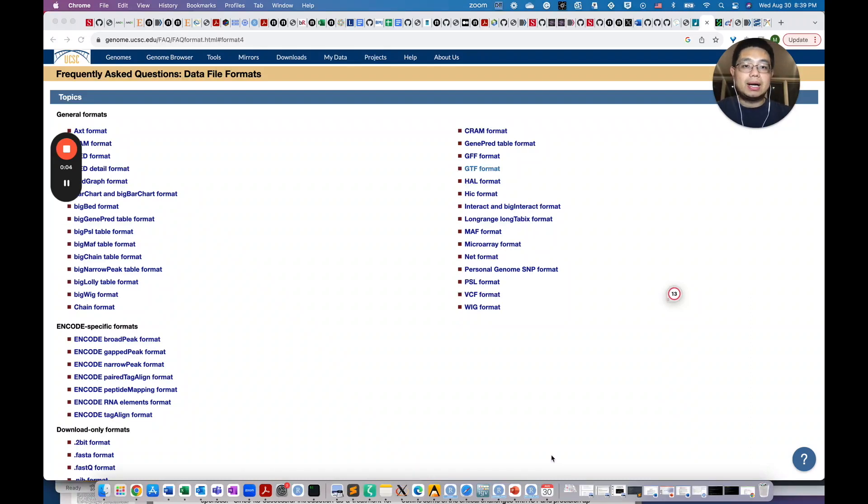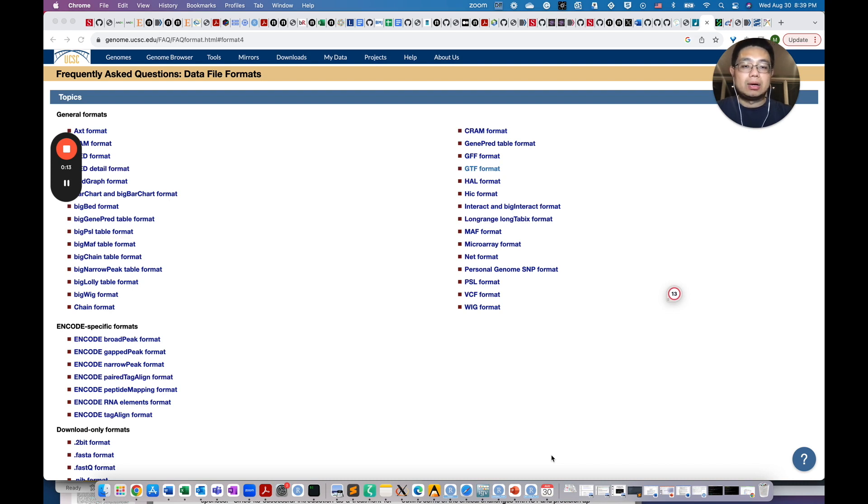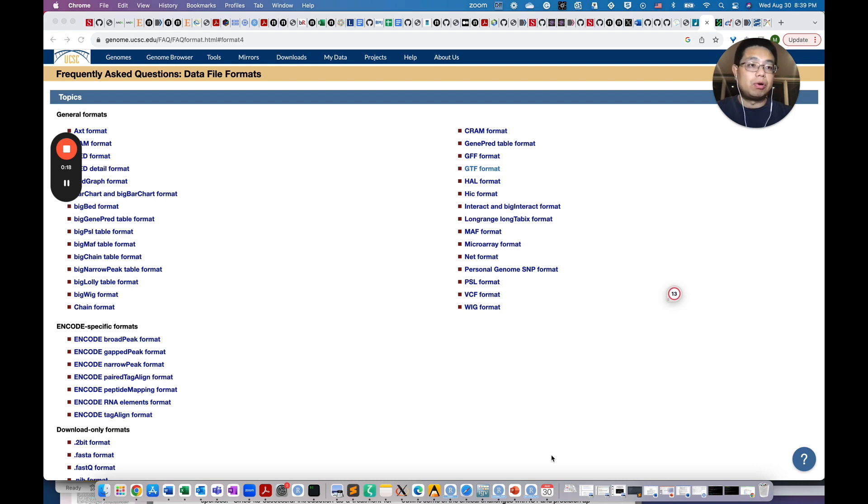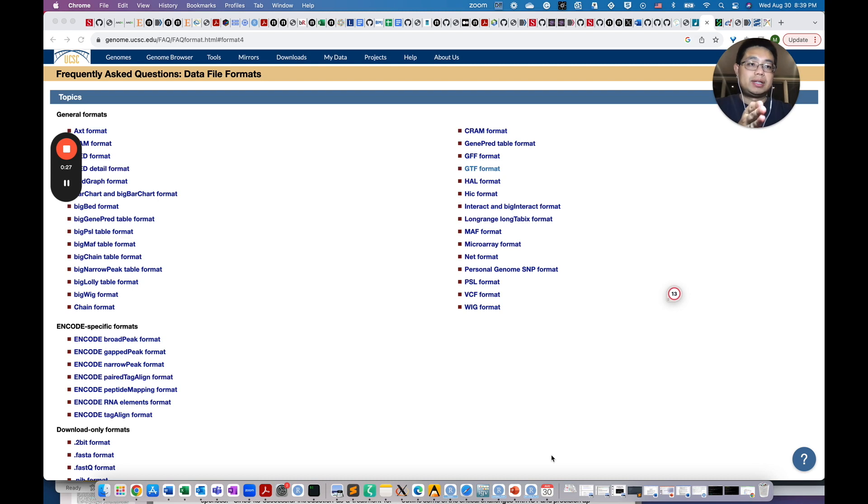In this video, I'm going to share with you four different places that you can download genome and transcriptome FASTA files and also gene annotation files such as the GTF file or gene transfer format. It tells you, for example, from chromosome one, this coordinates to this coordinates is gene one and this coordinates to the next coordinates is gene two.